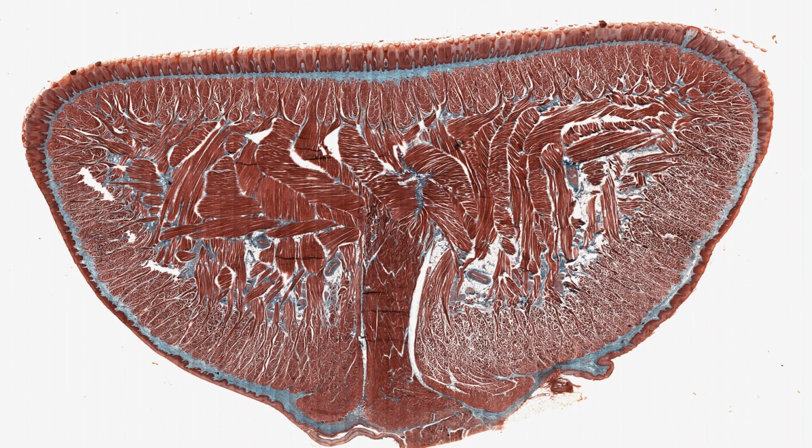I now wish to focus on longitudinal profiles of skeletal muscle fibres. This cross-section through the tongue of a rabbit demonstrates skeletal muscle. It's been stained by the Masson technique to distinguish the muscle fibres from connective tissue. A layer of stratified squamous epithelium, stained reddish-orange, surrounds the tongue.